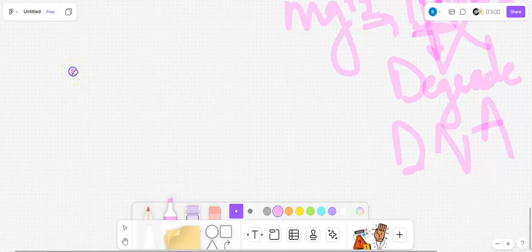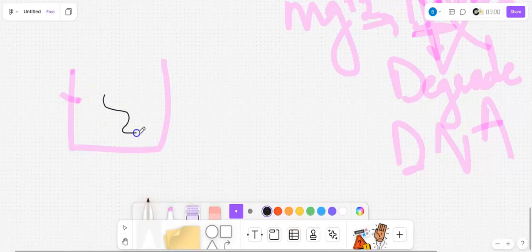Alcohol precipitation ఎలా అంటే again separate చేసిన DNA ఉంటుంది కదా, this separated DNA will be taken. Initial గా ఈ DNA తో పాటు some of the chloroform will also be present, and the polar compounds which are present in the cell will also be added.